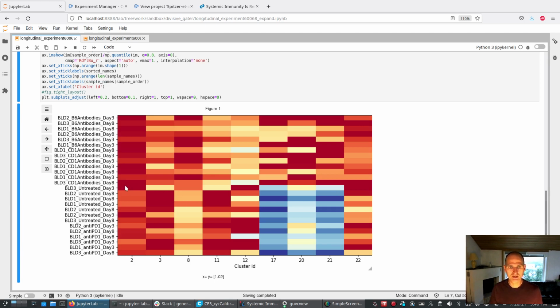First I correct for the variation of sizes of the files, so that just because a file has many events doesn't make it more red.